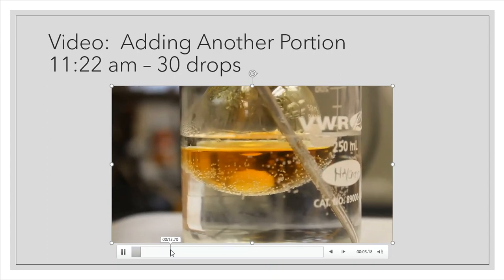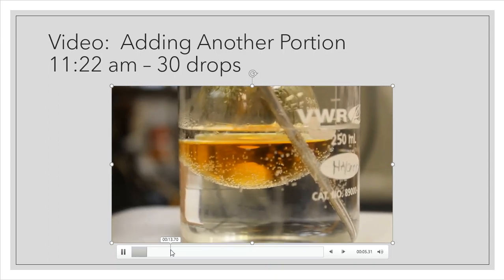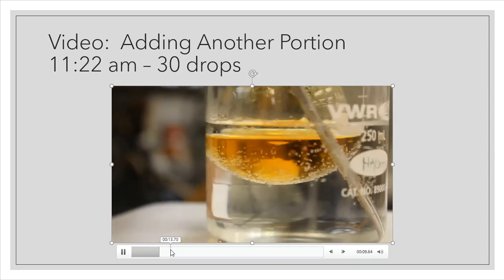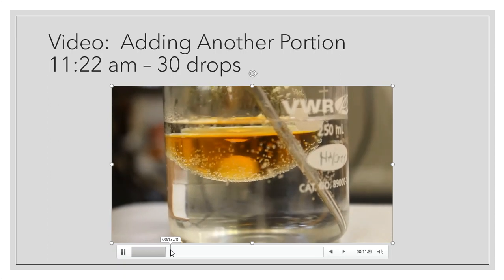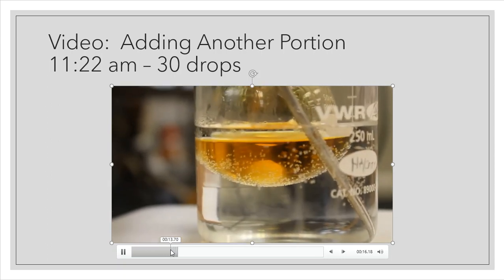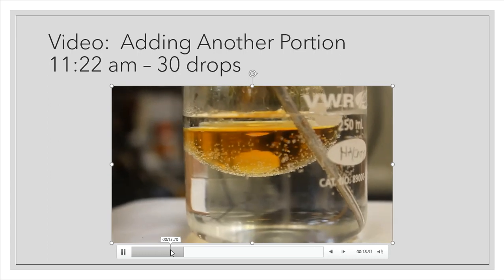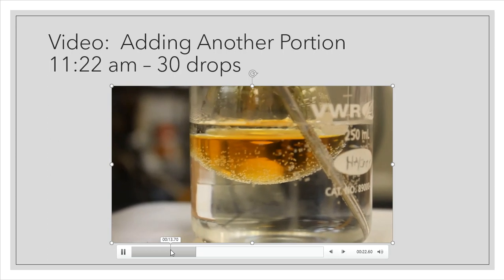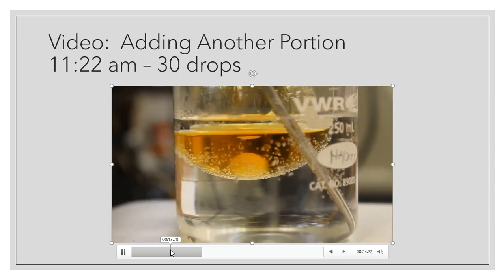I'm getting ready to add my next portion of bromine, and I want you to see this color change that begins to happen that they mentioned in the lab procedure. So right now I'm at this kind of goldy color, very light orange color that it tells me to wait for before I add the next portion of bromine. Right now I'm getting ready to add my next portion. I'm going to add about 30 drops at a time. That's the way that I do this.